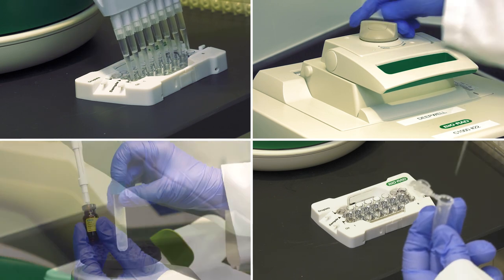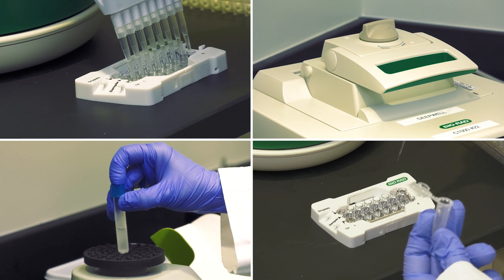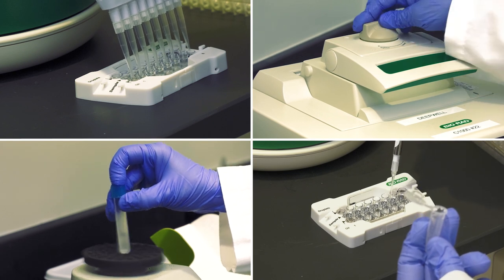This workflow provides the fastest, easiest, and least expensive way to measure cell modifications at the DNA level.